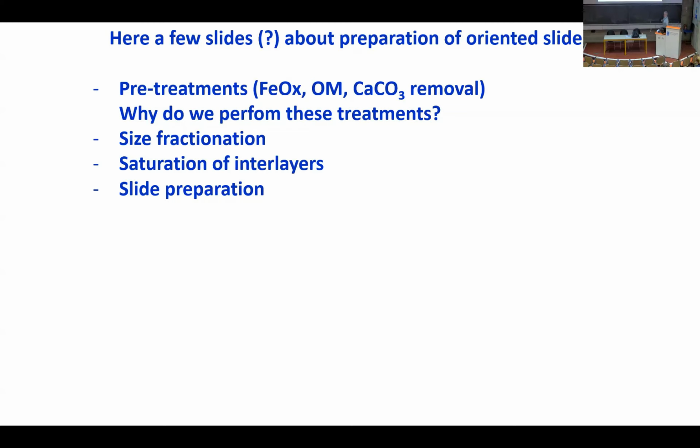One thing you have to think of here is, when was this treatment proposed? And most of these treatments were actually proposed in the 1950s. Just think about what was the intensity of X-ray tubes at that time, and what was the ability to remove, for example, fluorescence of iron from your data.